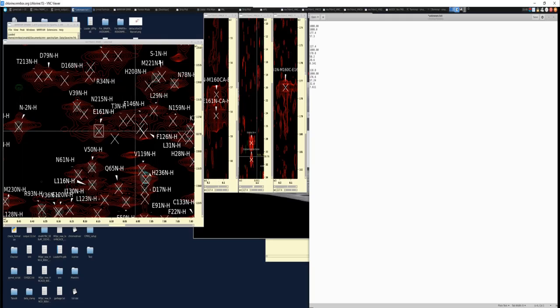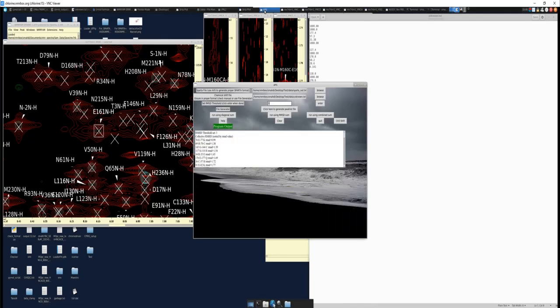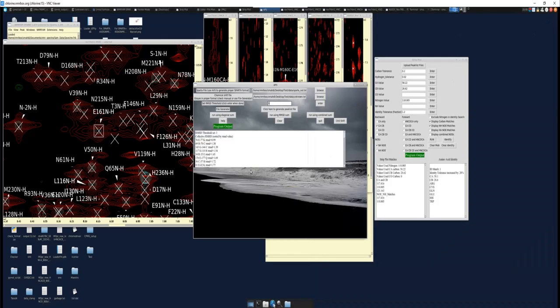C beta is 31.38. And then we do not have an amide hydrogen value for this. So let's click save, go to APS again, and we'll minimize this. And let's run it again.